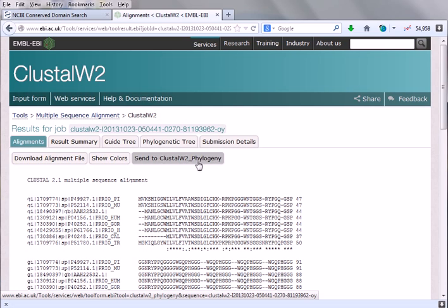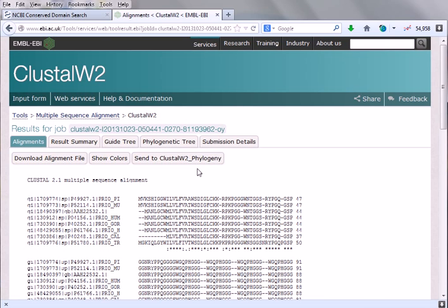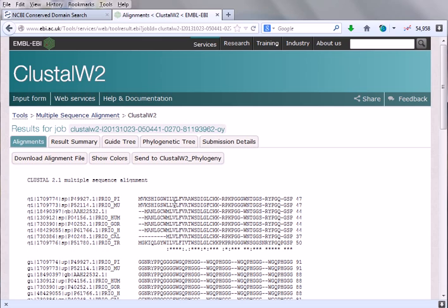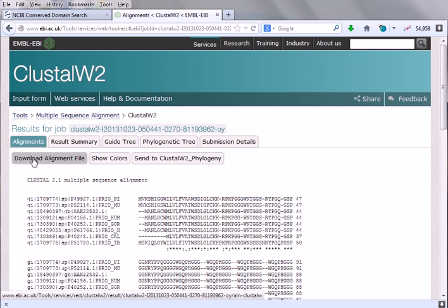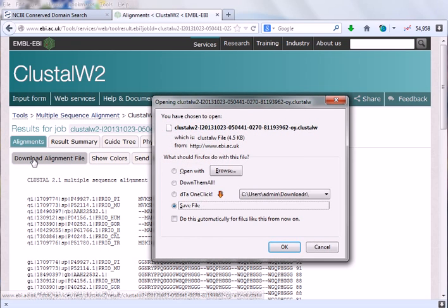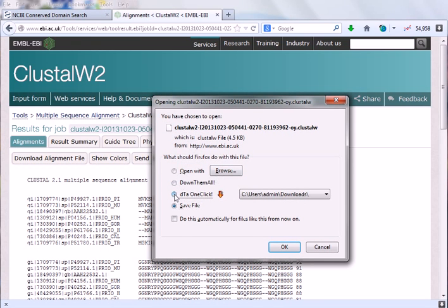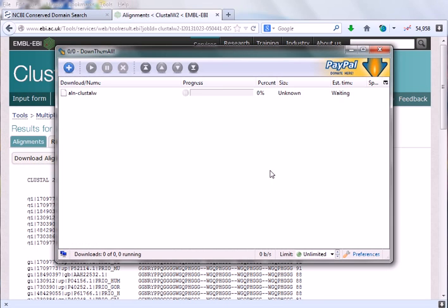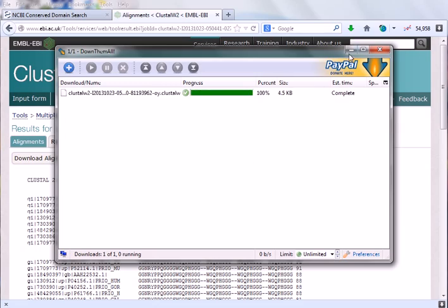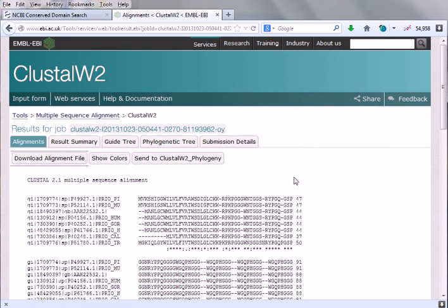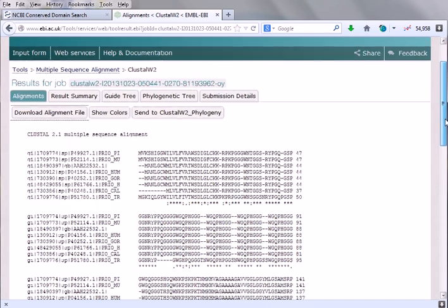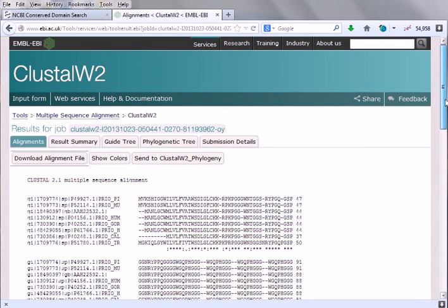Here it also says send to ClustalW2 phylogeny. If we click this button, it will take our information and send it to the ClustalW2 software phylogenetic analysis, and it will create a phylogenetic tree with our molecular evolution pattern. What we will do is simply download this file by clicking here. Simply click here and it will take us to this page. We will just save this page into our computer. Save. Now until that point, everything is fine. The alignment is done.